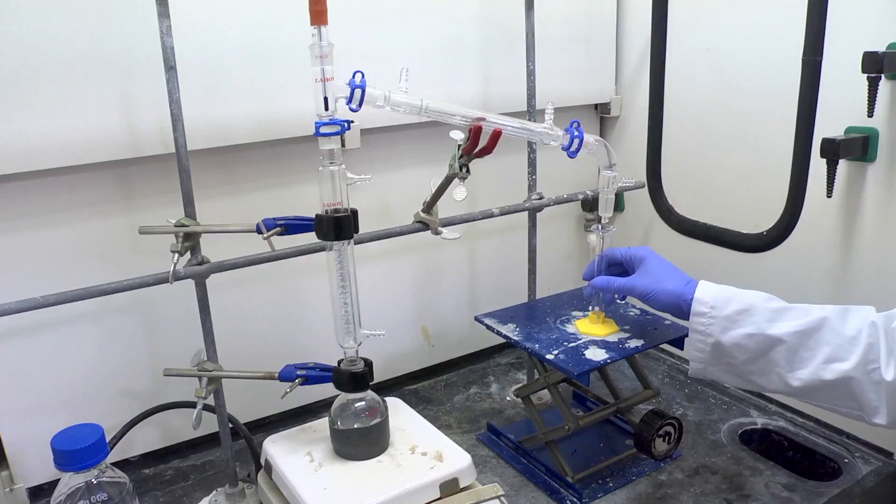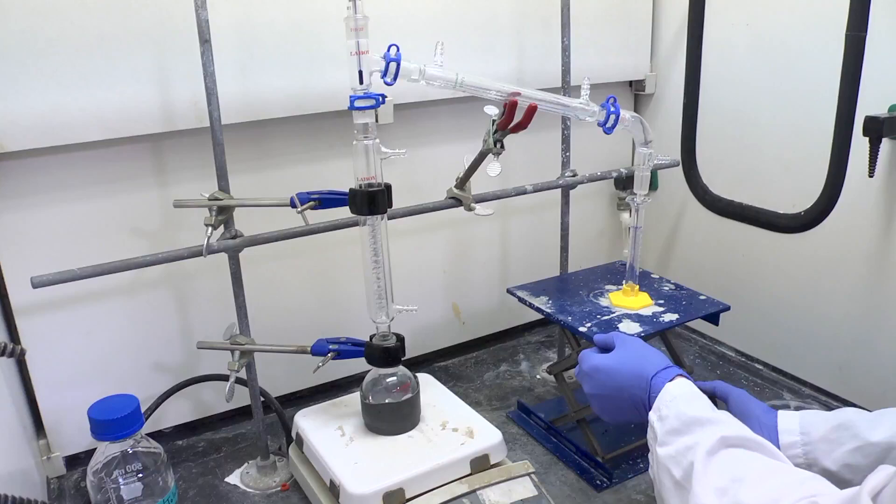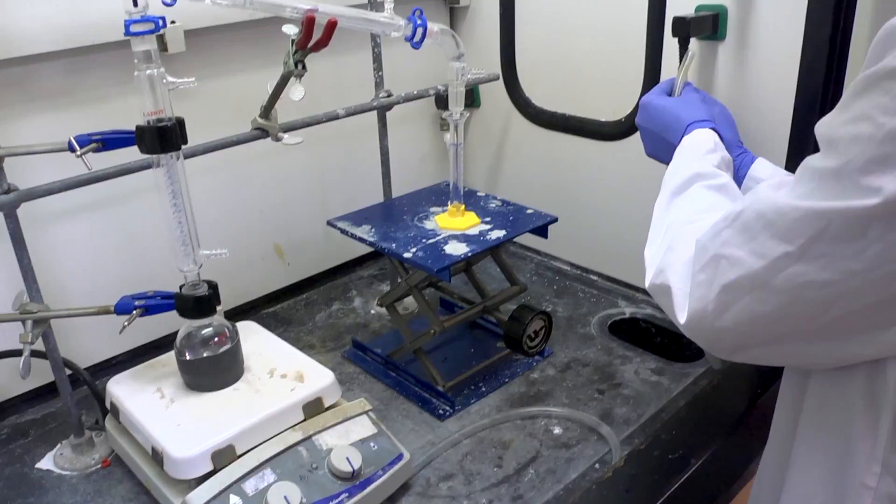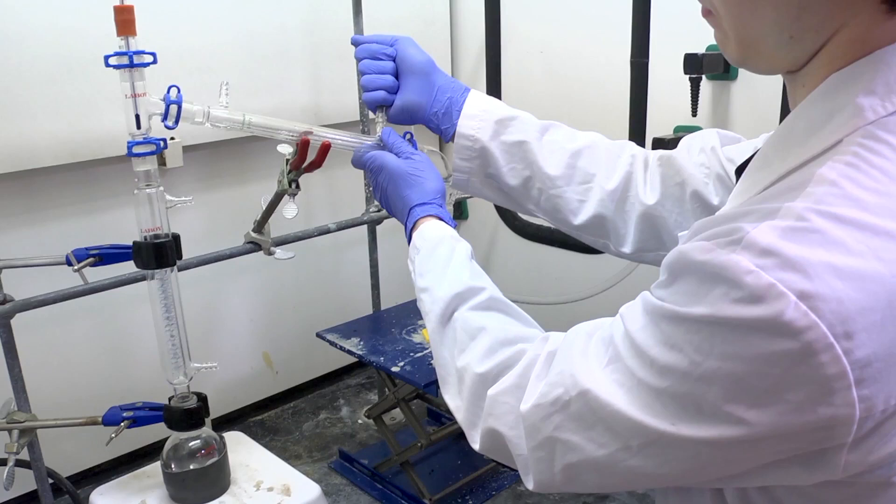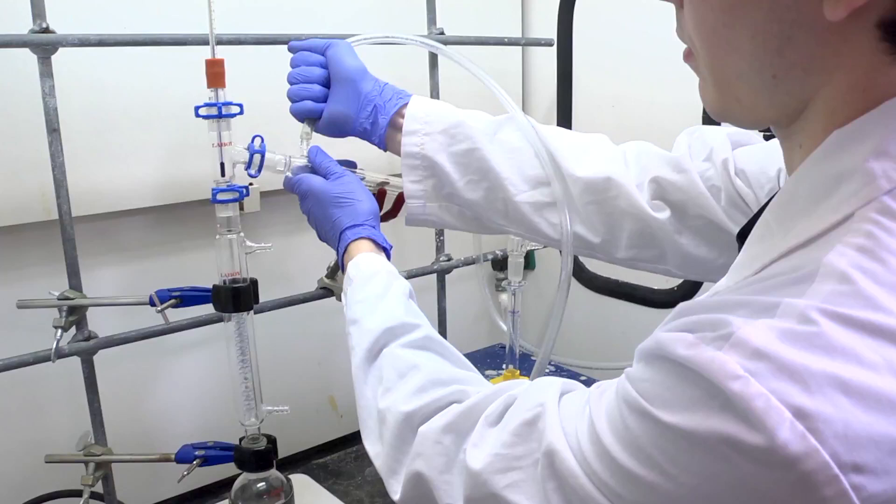Now you can set the graduated cylinder beneath to collect the distillate. Make sure your setup can be lowered in case the mixture gets too hot. Check the joints to see that they are a tight fit. Secure the hose to the water outlet and then to the lower projection on the skinny condenser. Add the second hose and then to the top, and make sure that it runs to the sink.